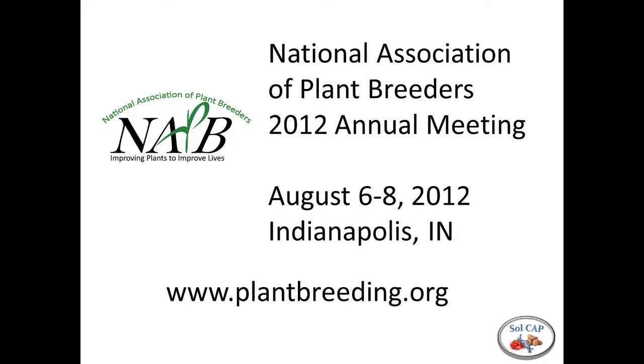Great. And I don't know if we can go back through here. Sorry, seeing a lot of questions pop up at once. There are several questions looking at populations that can be used. A specific question here is, can you use backcross 2 or more advanced backcross populations?